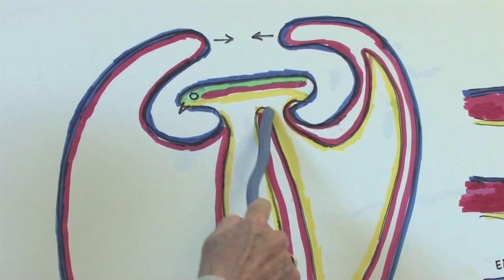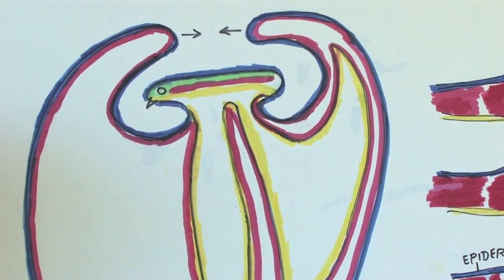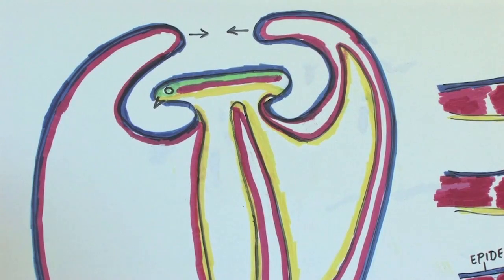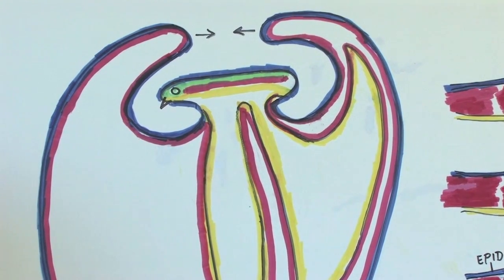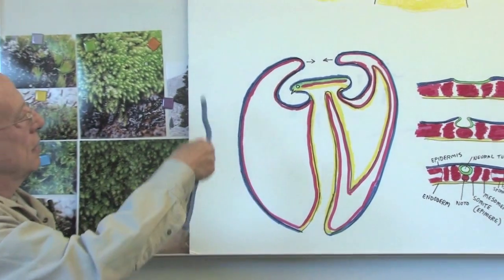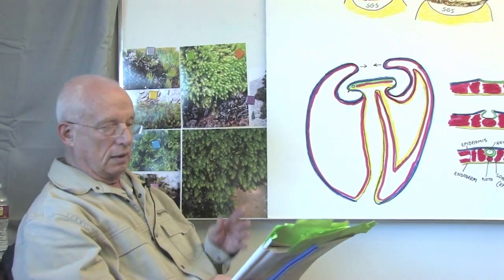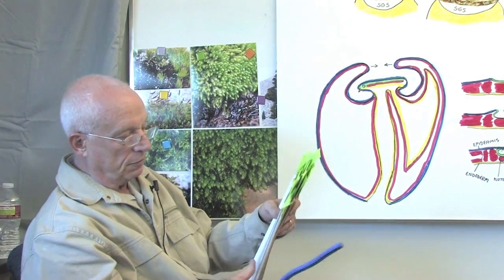And you have the allantois right nicely here, which is an outpocketing of the endodermal tube. So these color views make it much easier to understand what you see in a figure like figure number 54.